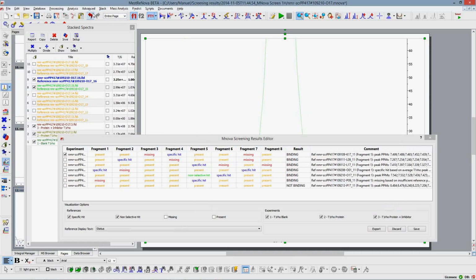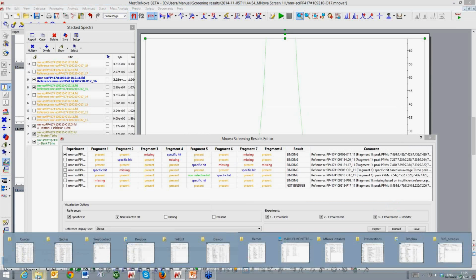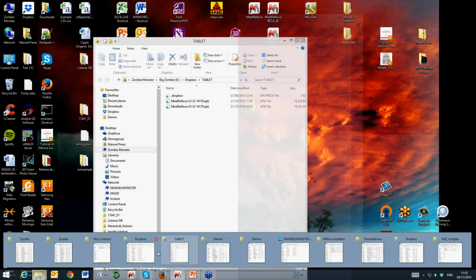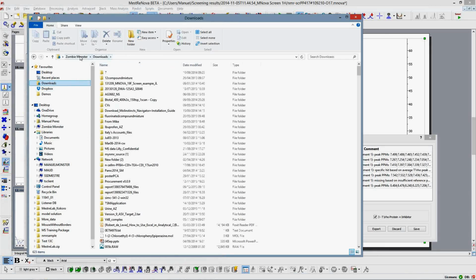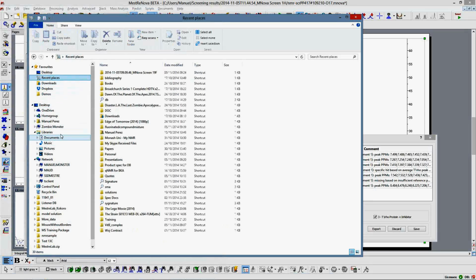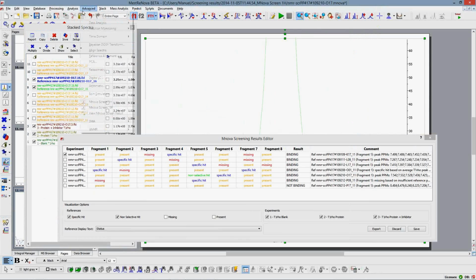The second layer that we are creating is, if you allow me, I can do this quicker.